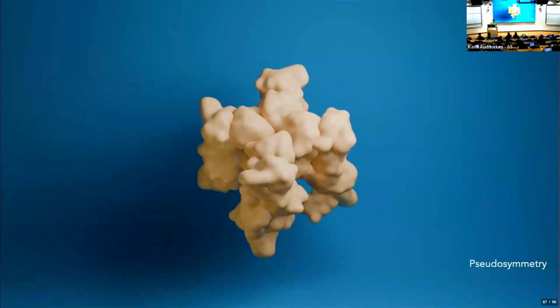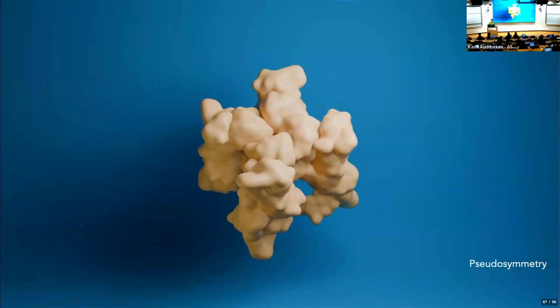In reality, almost nothing is symmetric, right? There's going to be this slight deformation so that those rotations are not perfectly the same. Because when you say C4 symmetry, the computer says exactly the same, when really we're saying they're approximately the same, right? So how do we handle this? In some cases, it might be sufficient to say they're exactly the same.